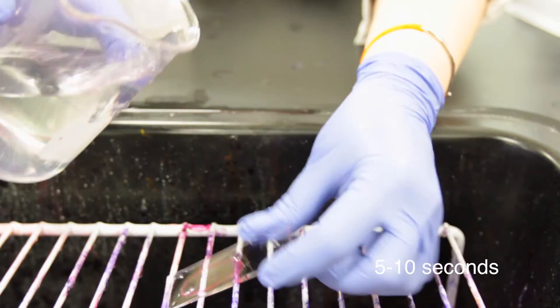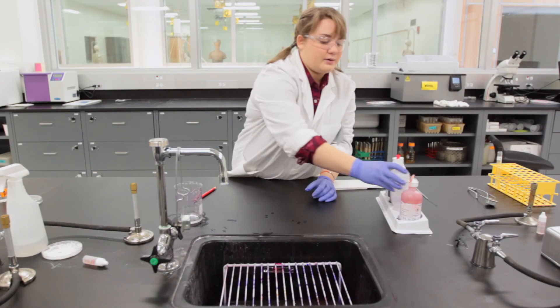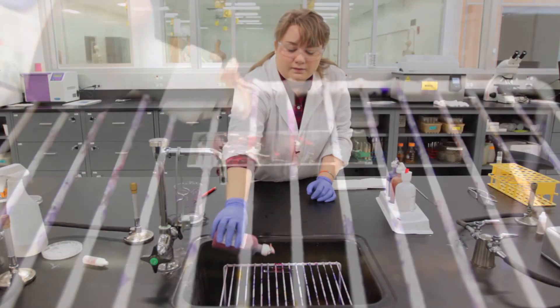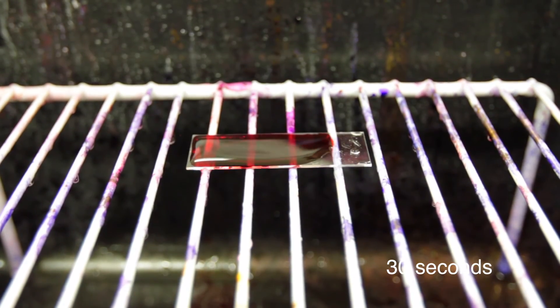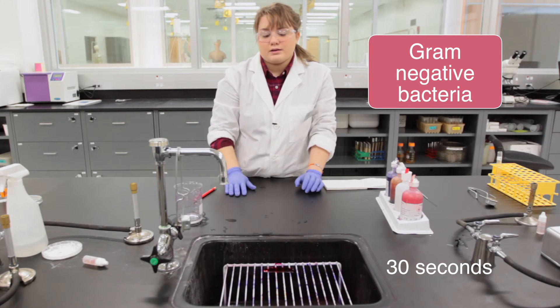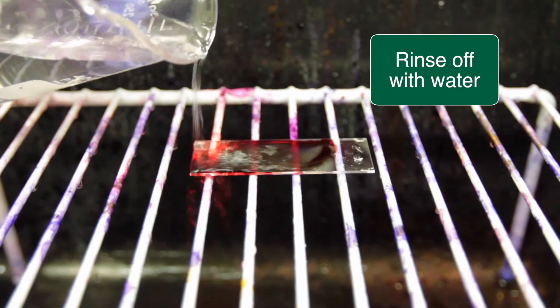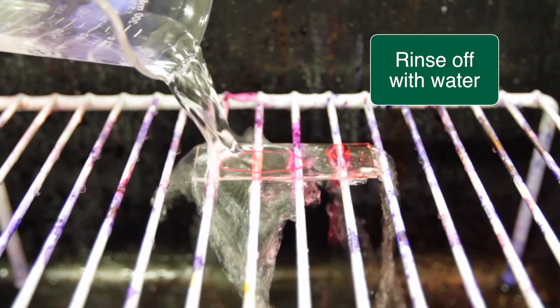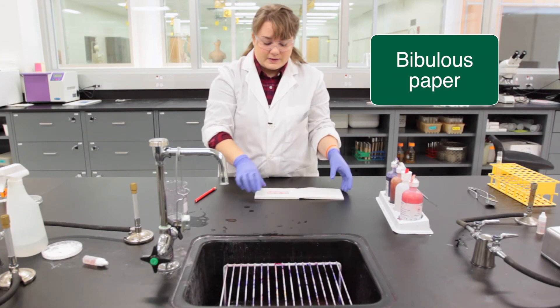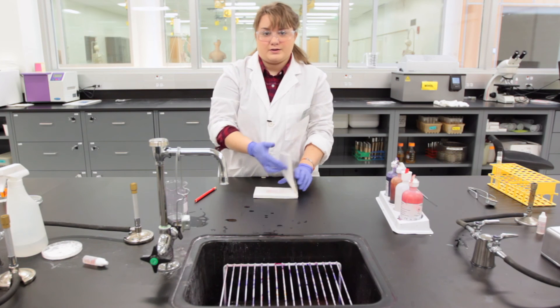Rinse off the slide and add our counterstain, which is safranin. This goes on for 30 seconds and will stain the gram-negative cell, which is currently colorless, pink. After 30 seconds, rinse it off. The slide is now ready to go into bibulous paper to be dried and visualized under the microscope.